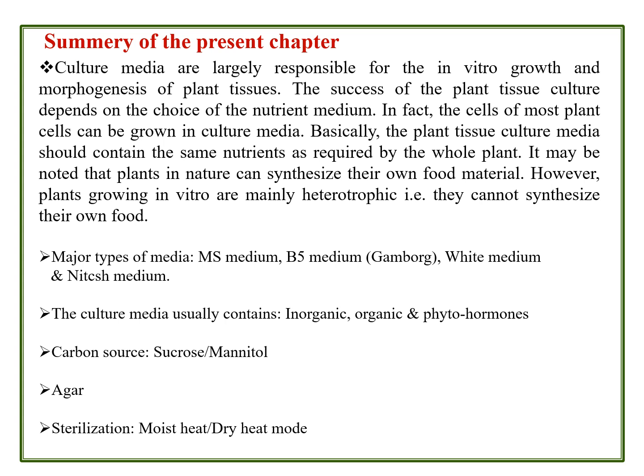Agar is used as a gelling agent that holds all the organic and inorganic components as well as the phytohormone concentrations in intact form and makes them available to the plant cell, or a callus cell or a meristematic cell.